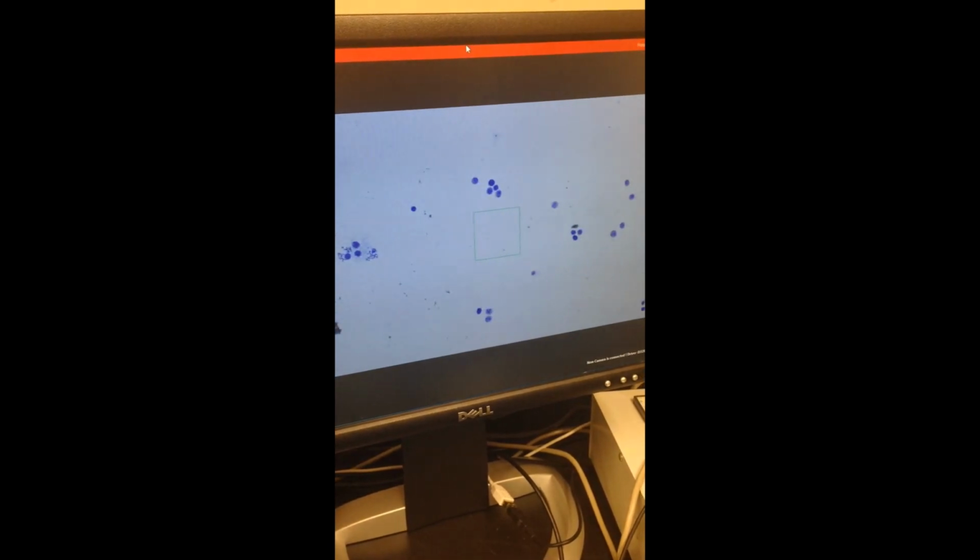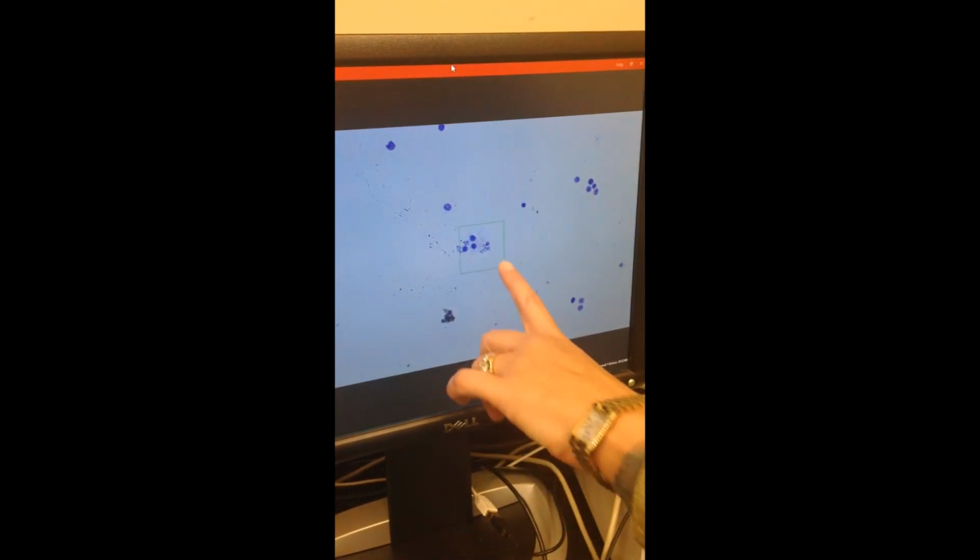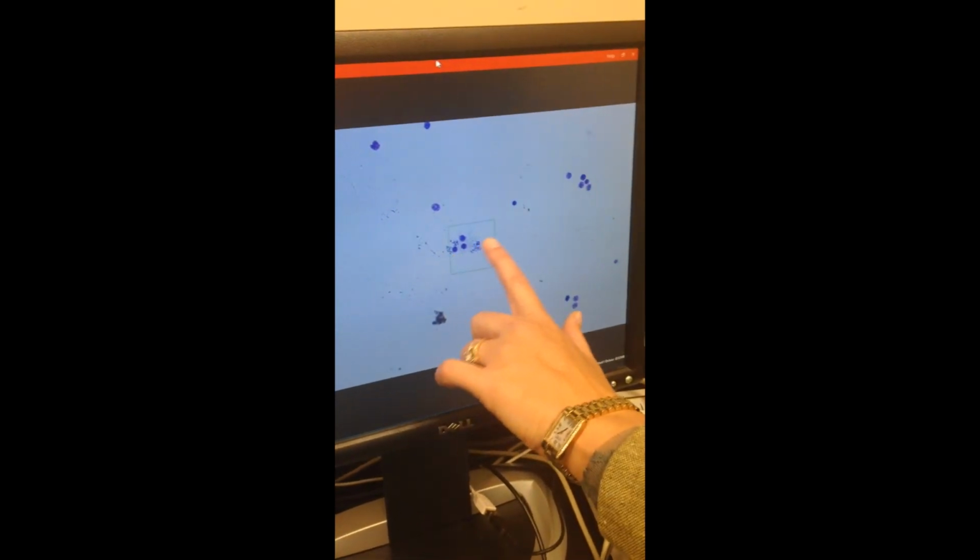They'll look like little dots. So what we'll need to do is go up a power, and this is 10 with the total magnification being 100. Focus there. If you'll notice, most of the cells on your slide will look like this. And if you remember, the goal of what we were doing was to break that cell open. And so you can tell that this is a good sample to look at. These cells have been burst open and their chromosomes have splattered out.